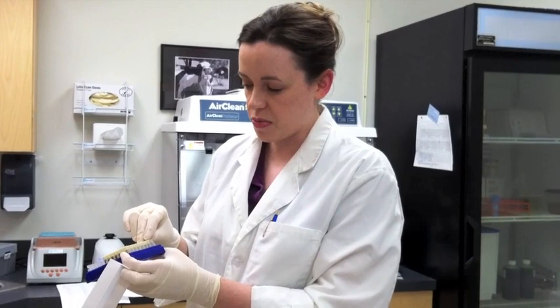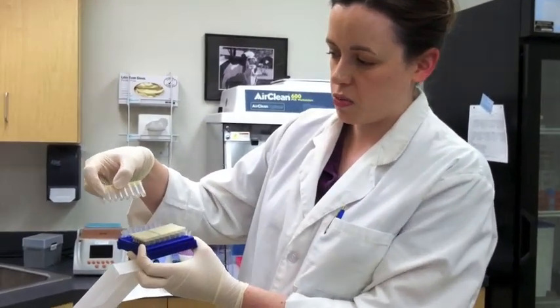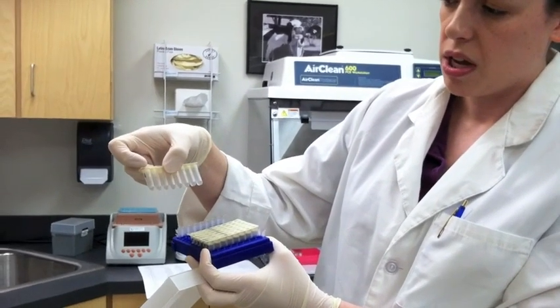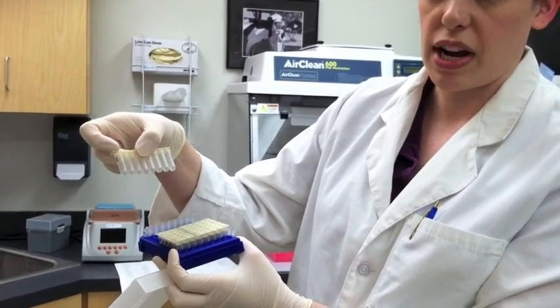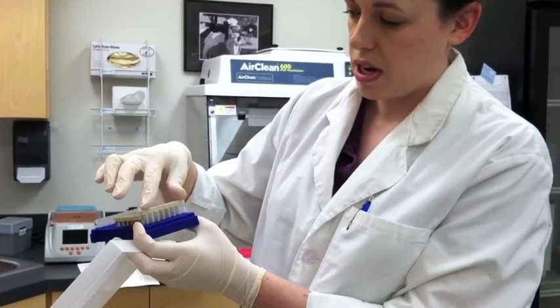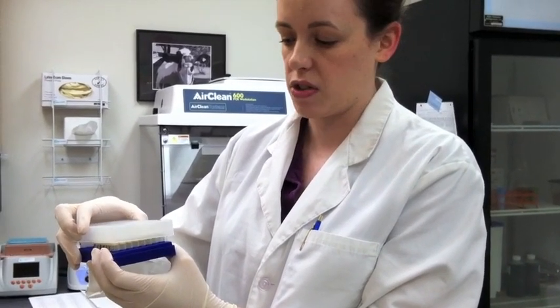After the extraction process, we end up with strips like this. Each of these eight corresponds to an individual cow sample — about 100 microliters of liquid with the extracted mastitis DNA from each cow. That's what we use to make the plate under the hood, and the plate is what we put into the machine to get our results.